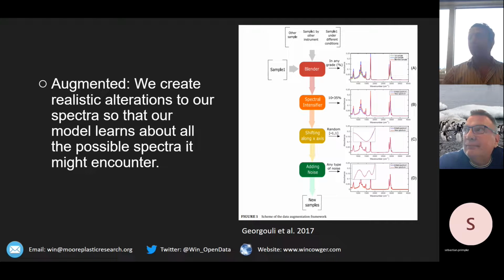I can share afterwards. I'm just curious about the actual method of transferring the crushed Anodisc into the little pyrolysis cups, because I've used tiny pyrolysis cups and weighed stuff in. What kind of oven do you use for pyrolysis? A Frontier one. Is this a micro furnace? I think it's a micro thing, these small things. We can have a look at it.